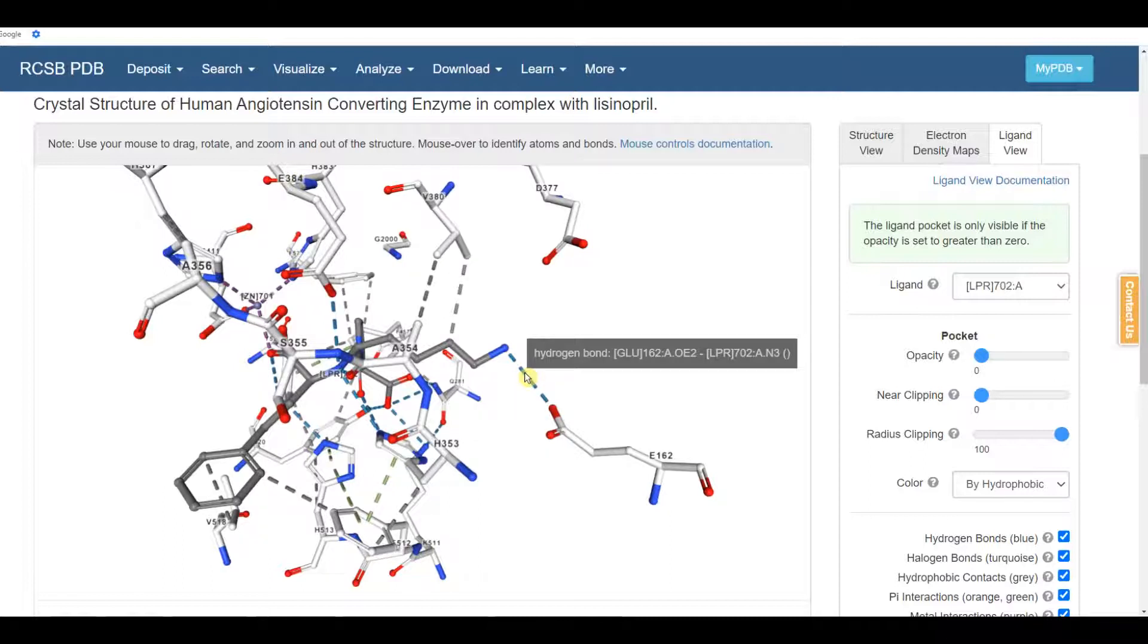That's a hydrogen bond between glutamate, a glutamic acid residue in the protein, and lisinopril, and nitrogen on the lisinopril. Notice that nitrogen atoms are shown in blue and oxygens are in red.